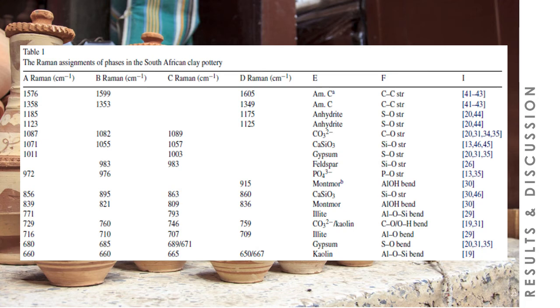This is critical to allow the complete dissolution of this clay mineral. Also, the Raman spectroscopy results confirm the complexity of clay minerals in which features resembling illite clay mineral are shown. In fact, the broad and intense band might be preceded by an overlapping of quartz and illite bands.